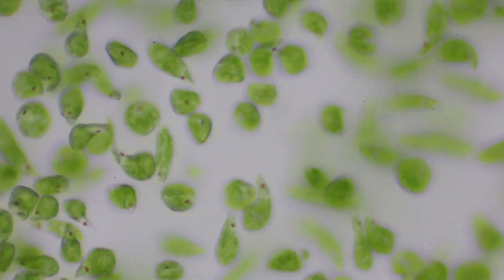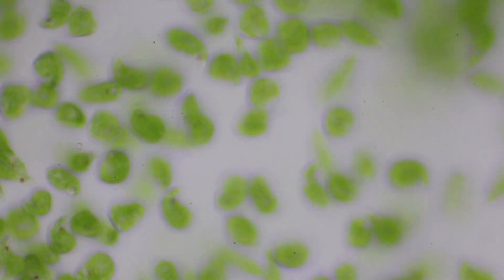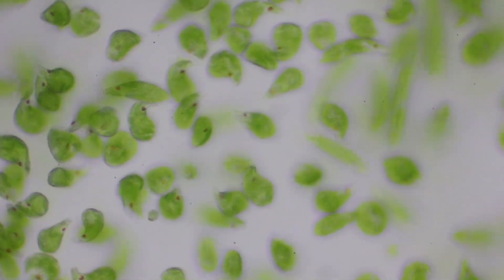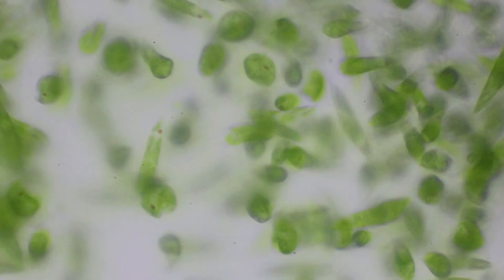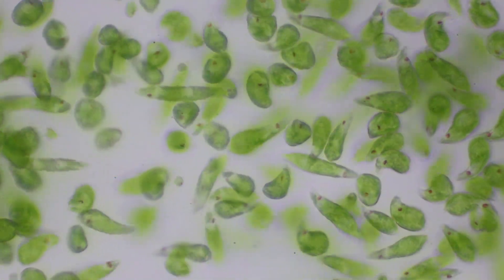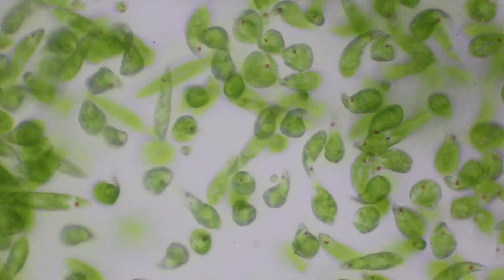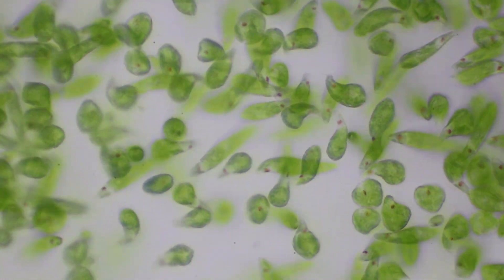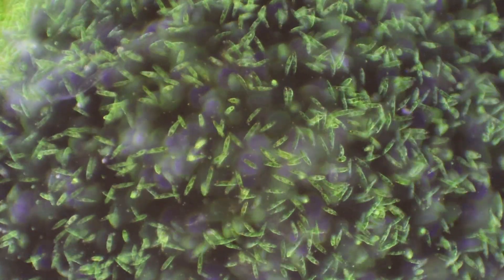That means they're actually trying to turn upside down because that's the area the light's coming from. This is not API illumination — this is dark field now.